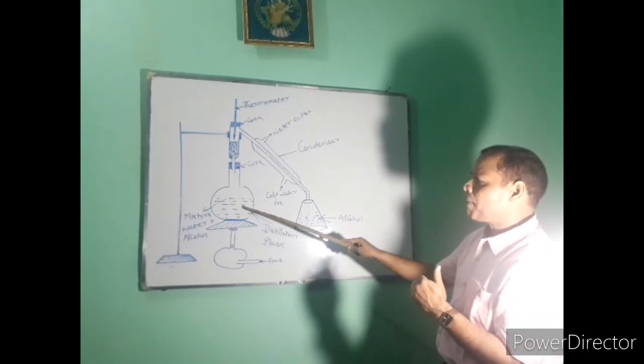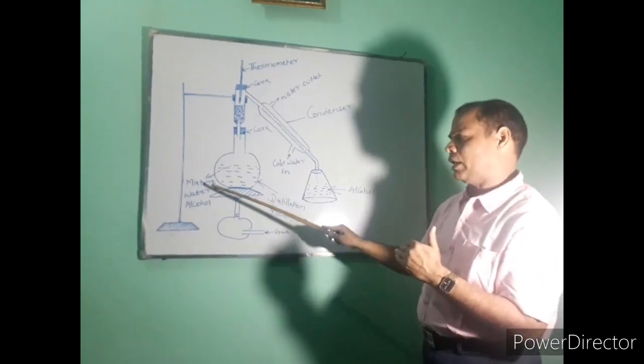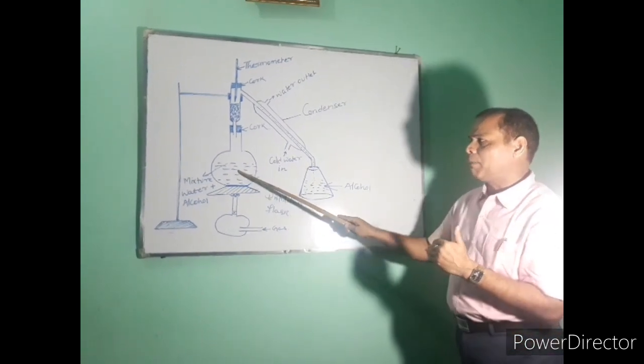So here in the distillation class we have taken water and alcohol, the mixture in a distillation flask.